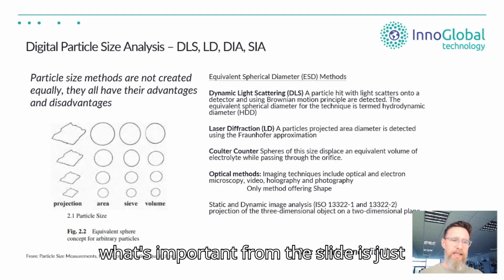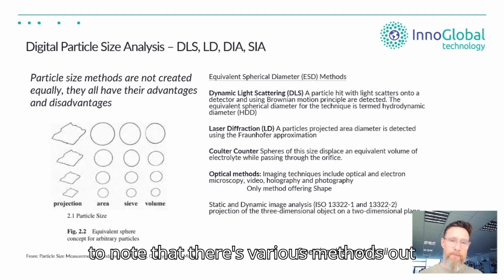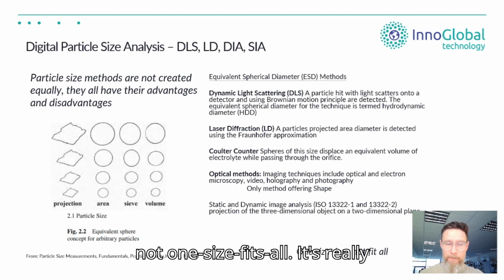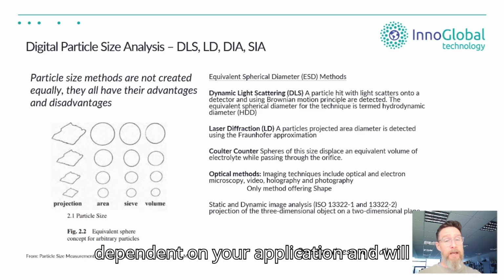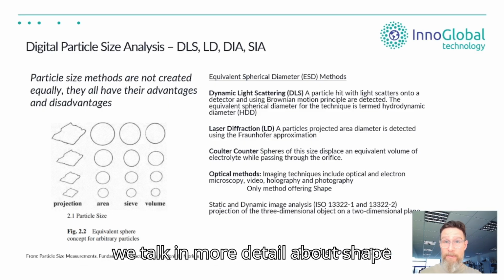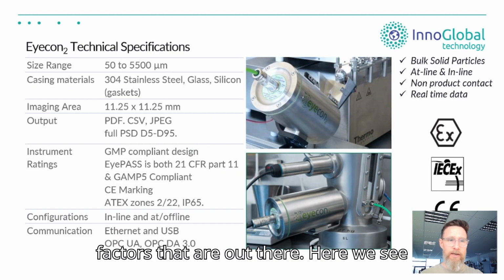But what's important from this slide is just to note that there's various methods out there to measure size and shape, but it's not one size fits all. It's really dependent on your application, and we'll get a bit more in depth about that when we talk in more detail about shape applications and all the different factors that are out there.